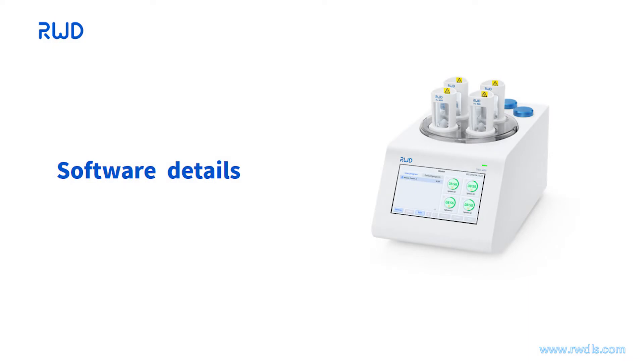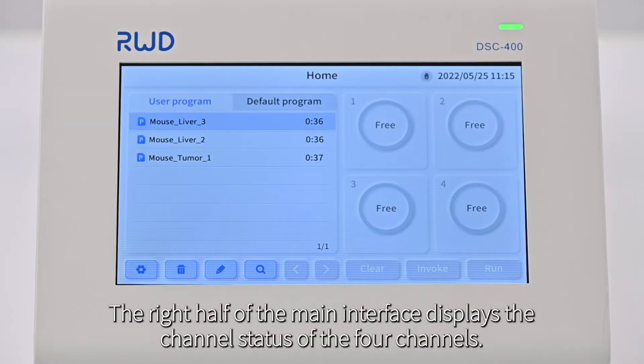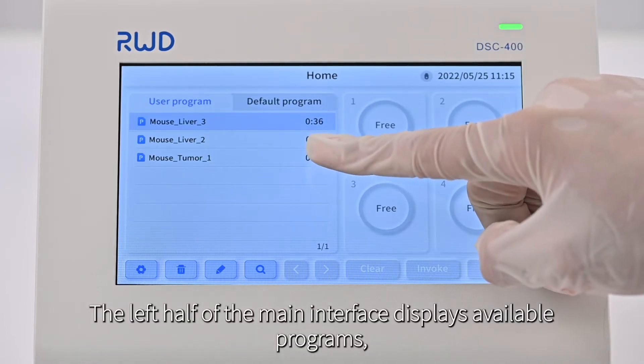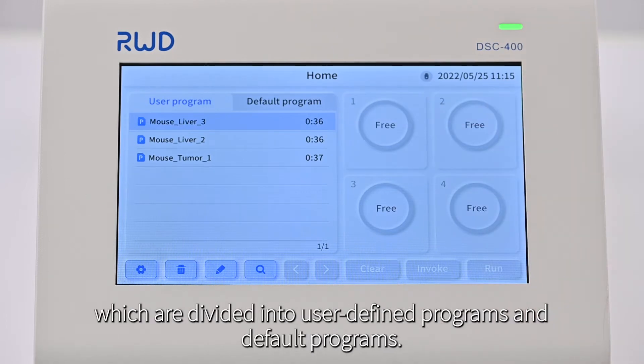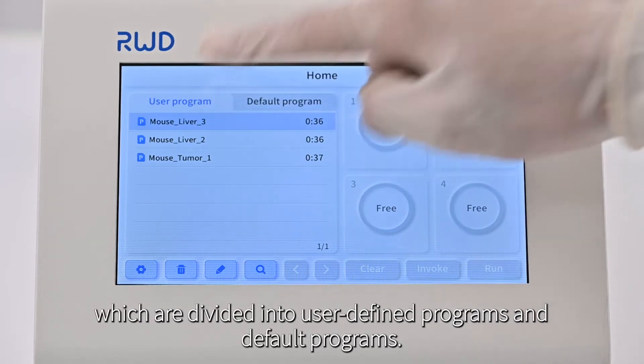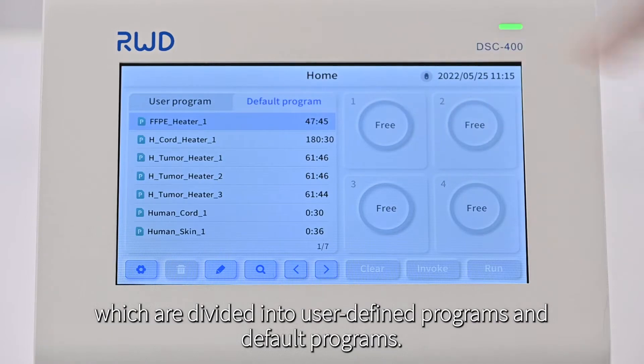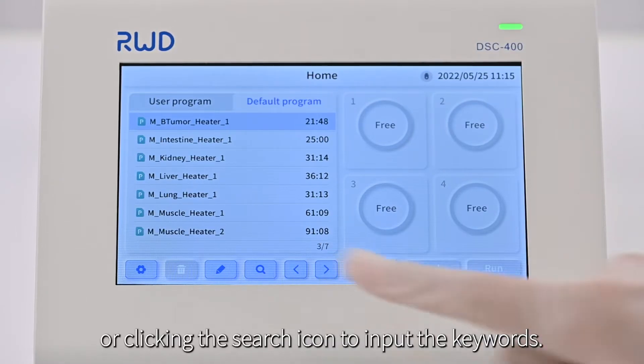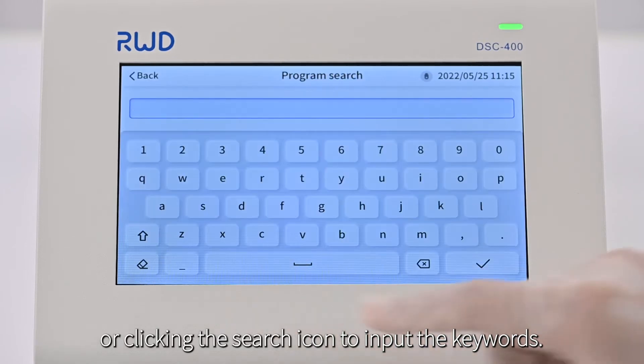Software Details. The right half of the main interface displays the channel status of the four channels. The left half displays available programs, which are divided into user-defined programs and default programs. You can search for a designated program by turning the pages or clicking the search icon to input keywords.